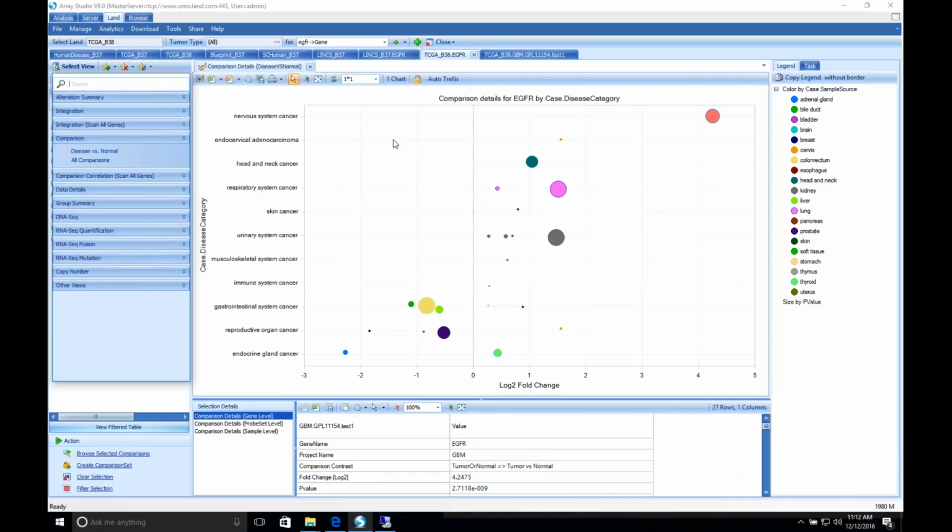So this is the first step for doing any of that. And I know from talking to some of our users that have used the version I created a couple of years ago that it is useful. There's the downside of it being pretty generic, where you're taking all of a tumor versus all of a normal, and I understand not all GBM samples are exactly the same, but it at least gets you a high-level overview of what's changing.